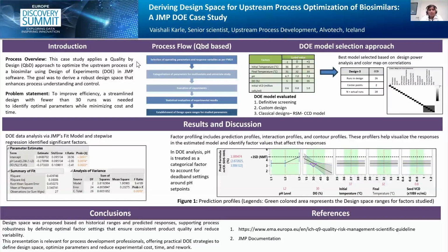So we compared the predicted values against our historical data, that is 3SD ranges, and we limited our expected or desired output value to the plus 3SD range. Like our output factor, that is HHL, should not go beyond the 3SD range. That is the desirability or expected values we wanted to limit to.